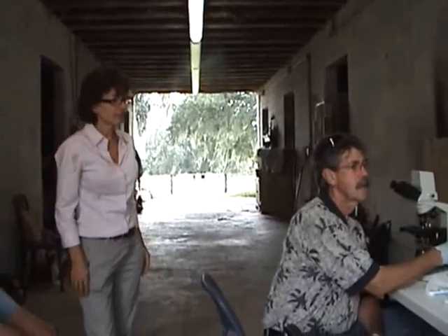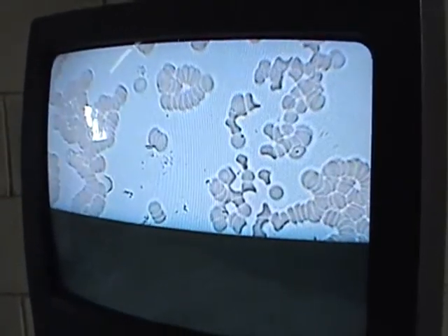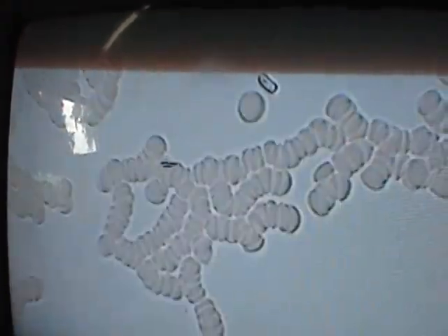Oh, here we go. What's that? Okay, that's uric acid crystals. That's joint muscle pain. Okay, here's your white blood cell. Every horse is going to look different, but those are uric acid crystals in there. See these chunks right here? All this going on here is all uric acid. And that's the role of those cells sticking together. White blood cells — you get one white blood cell for every 500 to 700 red. So it looks pretty similar.